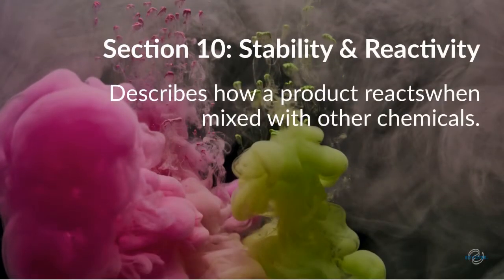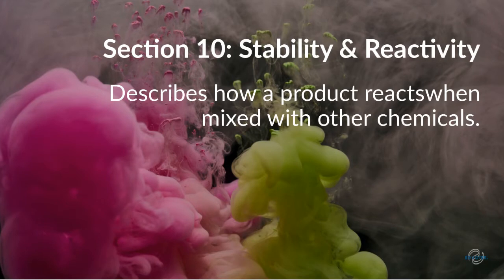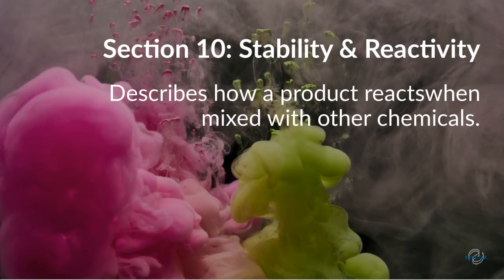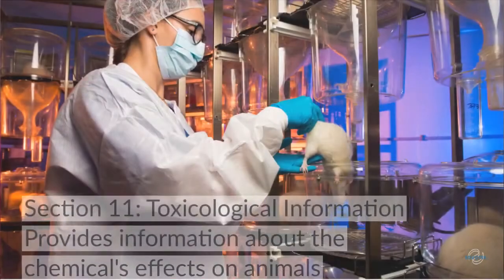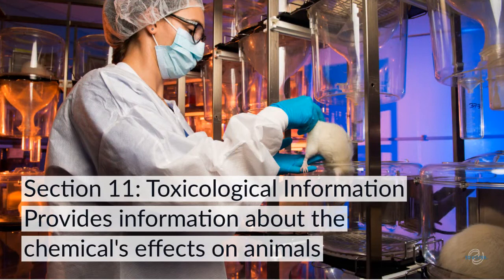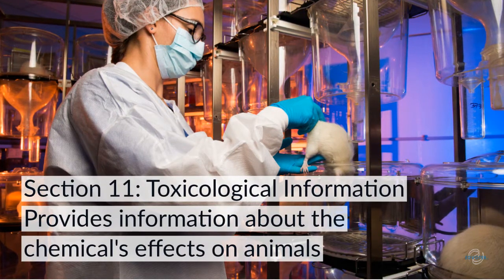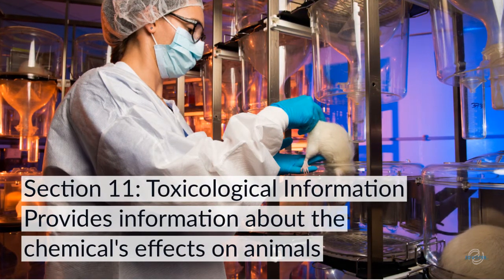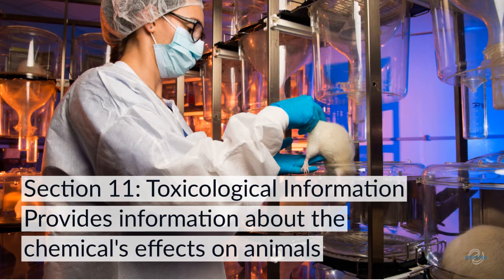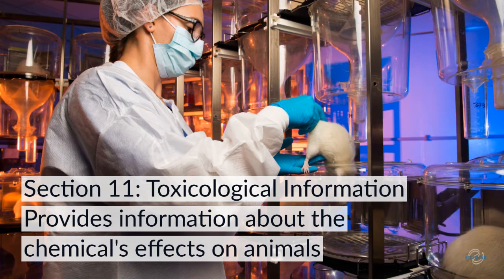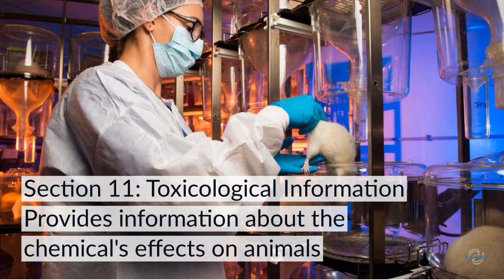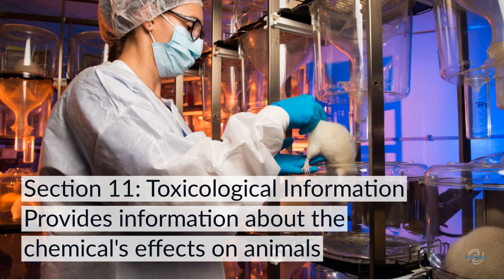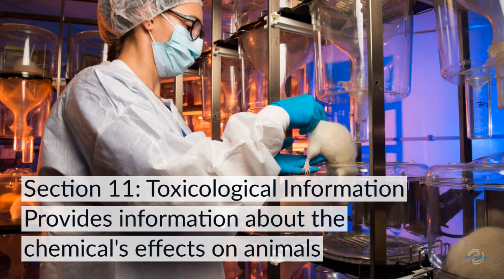If you need more information about a chemical's stability and possibility of hazardous reactions, you'll refer to Section 10. This section describes how chemicals react when stored and when mixed with other chemicals. Section 11 provides information about a chemical's toxicology, or the effects of the chemical on living creatures. This includes the routes of exposure, a description of symptoms both acute and chronic, and numerical measures of toxicity like LD50 and LC50.